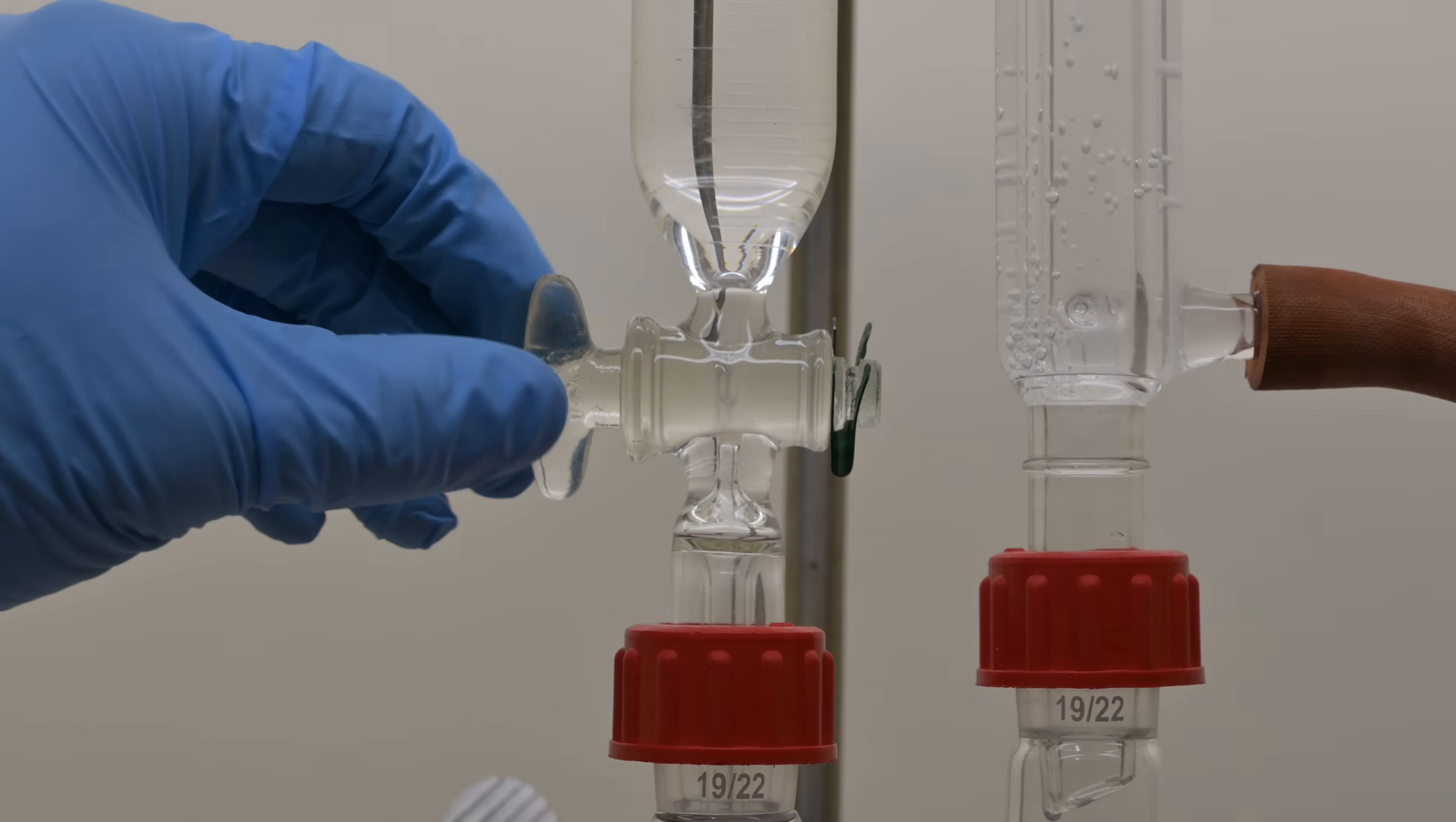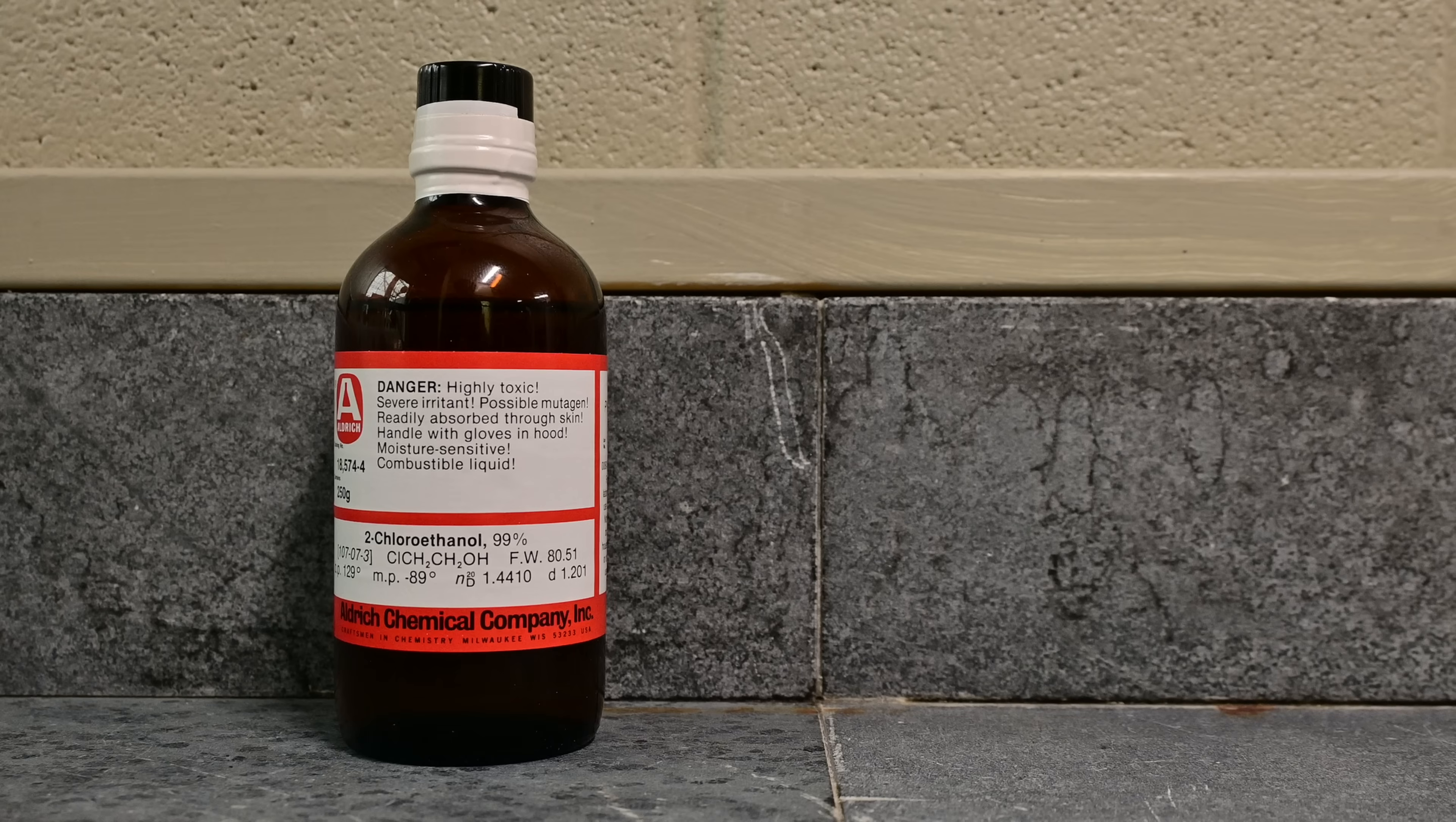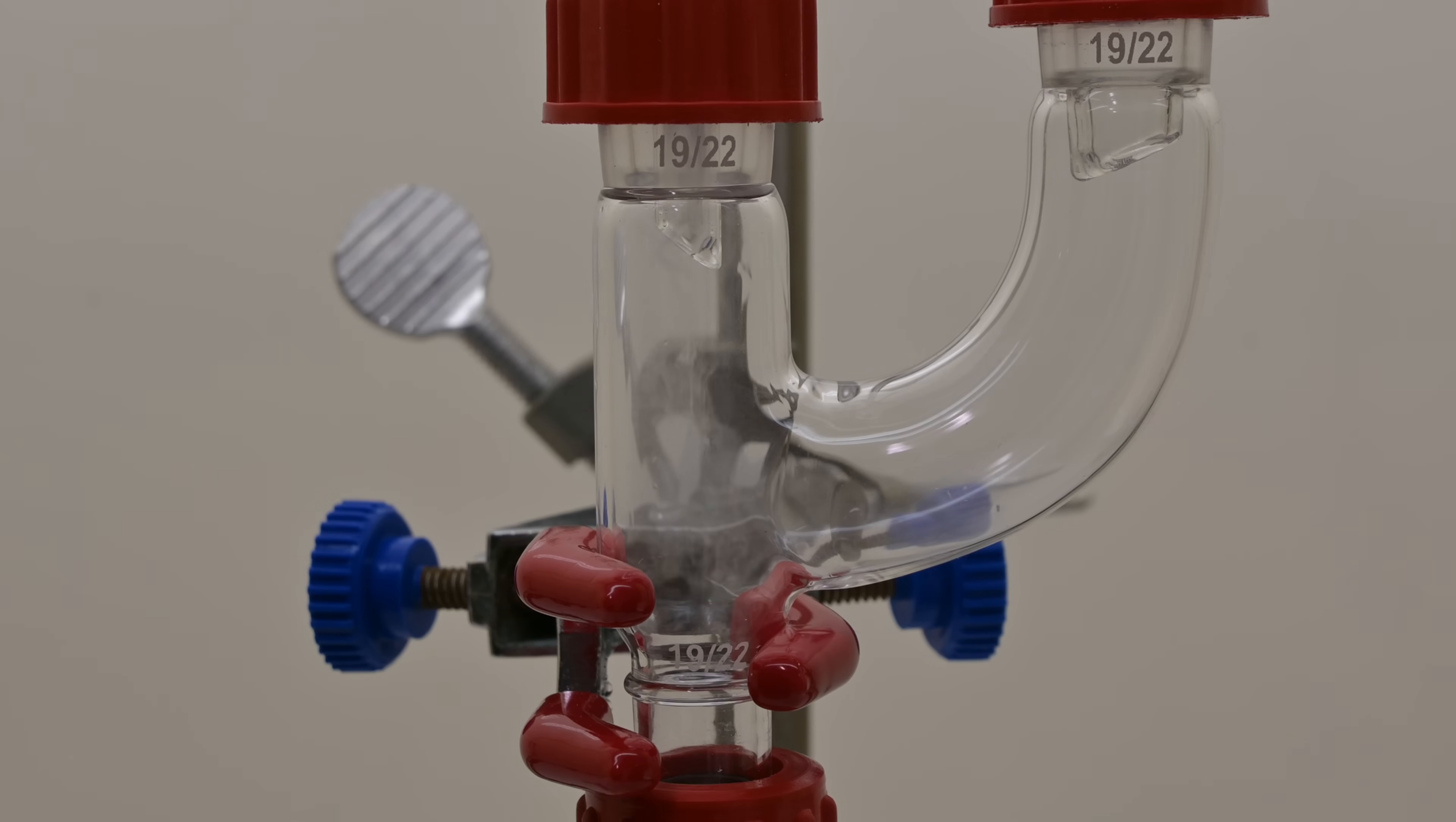2-chloroethanol is then slowly added dropwise through the funnel over the course of about an hour. 2-chloroethanol can also be absorbed through the skin, so I'm being extra cautious with spills and to wear thick gloves. The slow addition controls the rate of reaction and helps prevent a runaway exothermic reaction. What's happening here is a simple nucleophilic substitution. The nitrogen in the diethylamine attacks the carbon bonded to the chlorine, displacing the chlorine ion and forming a new bond with the ethylene group.